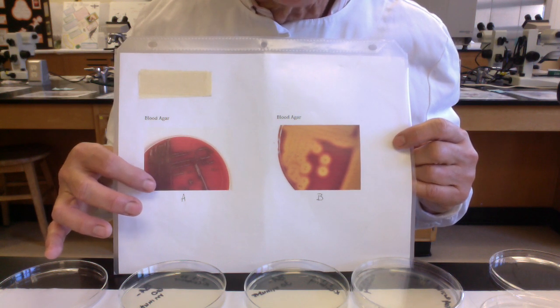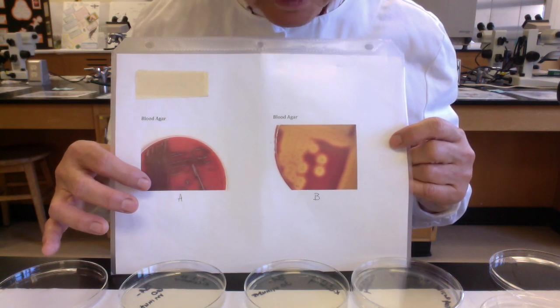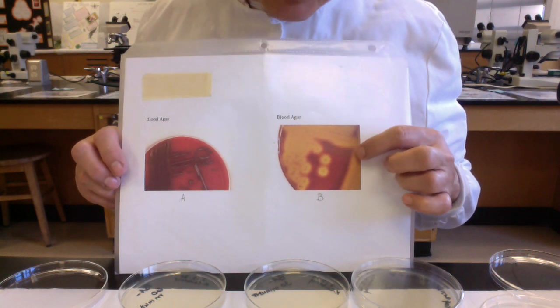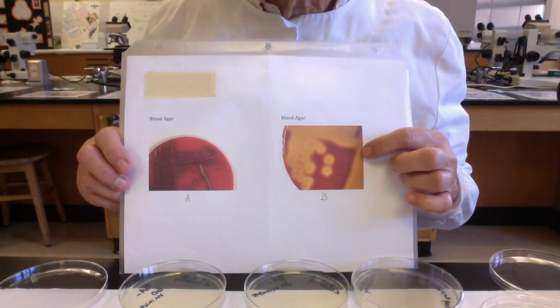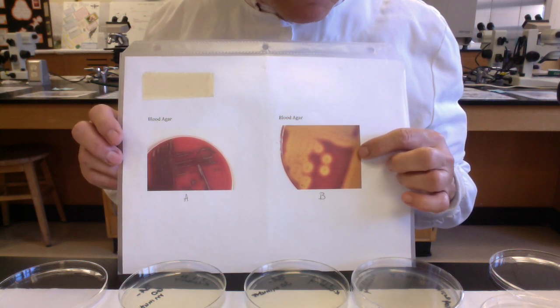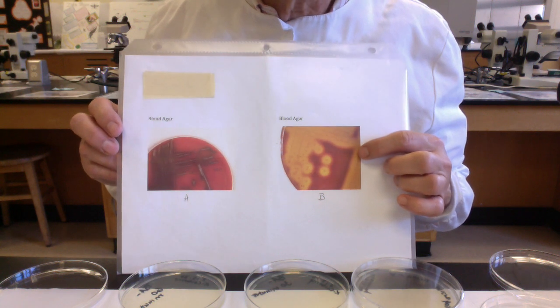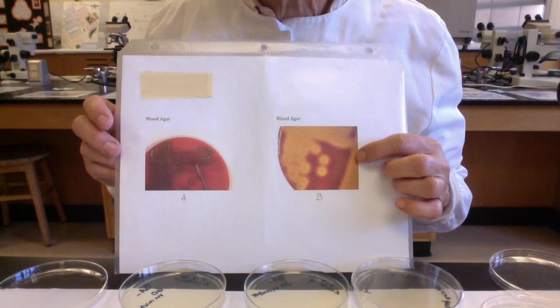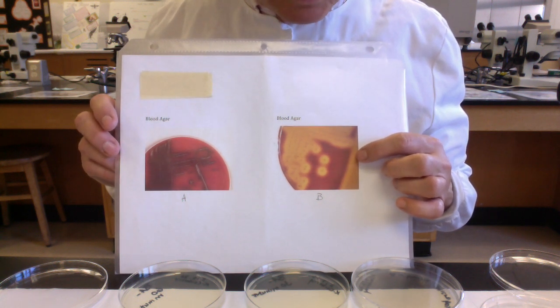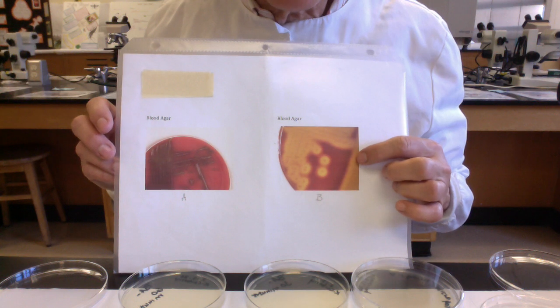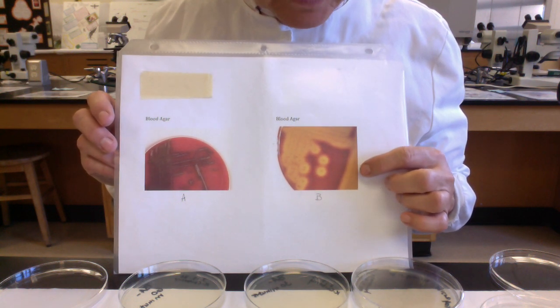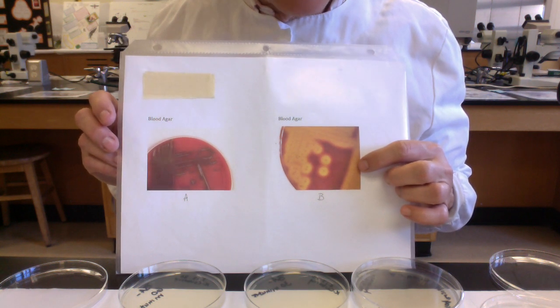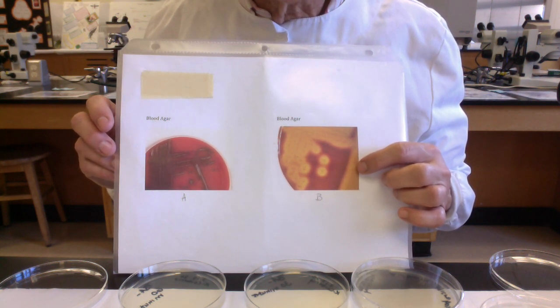Over here we have beta hemolysis. So just as an example, folks, maybe if this was pus from an infected surgical site and we plated it and we see beta hemolysis, we're really worried about it could be Staphylococcus aureus. If somebody has a sore throat, we do a throat swab, plated it, and we see beta hemolysis, we're going to be thinking about Streptococcus pyogenes, the group A streptococcus. If this is a pregnant mom and we do a vaginal swab and plate it on blood agar, and after incubation we see beta hemolytic colonies, we're going to be really worried about group B strep, the Streptococcus agalactiae.